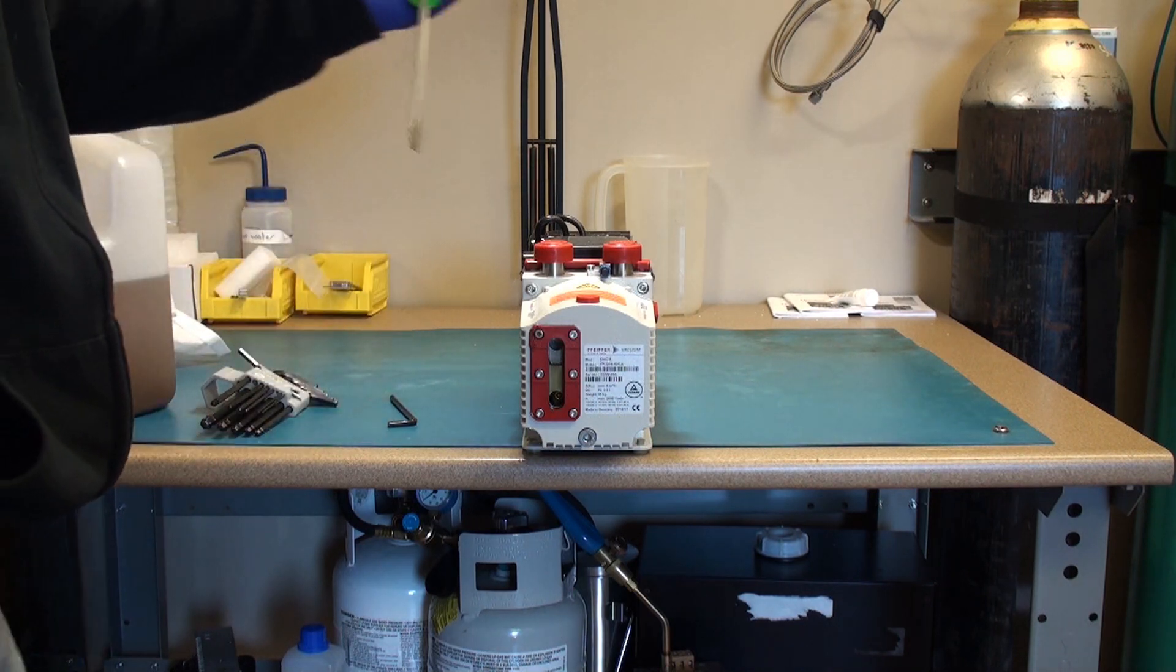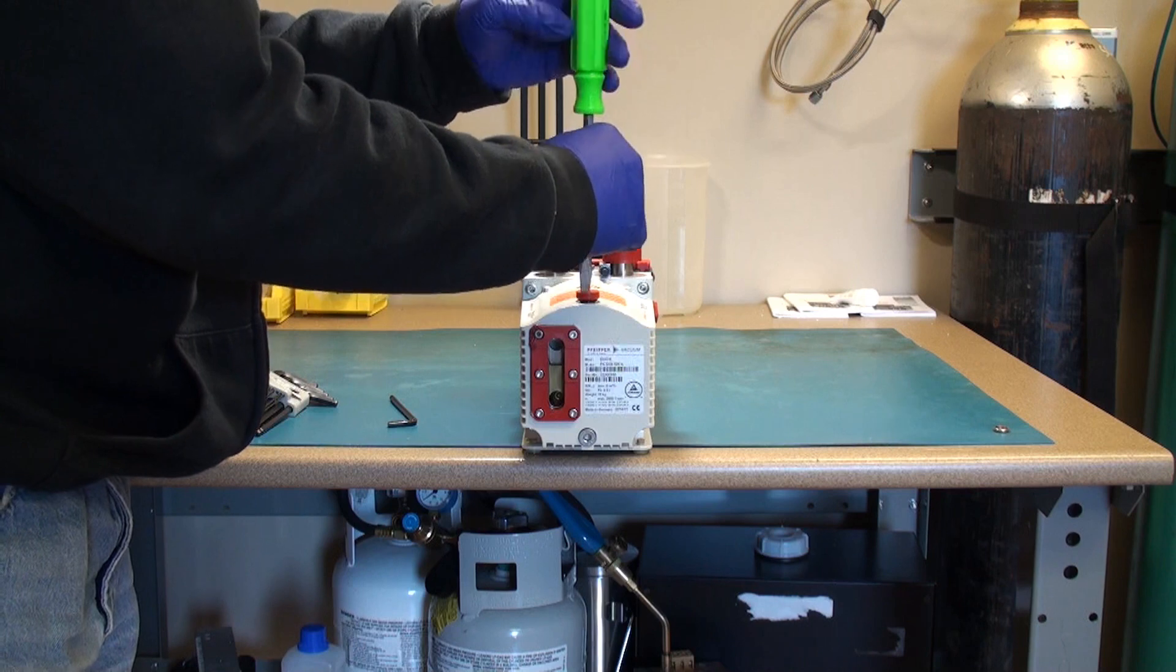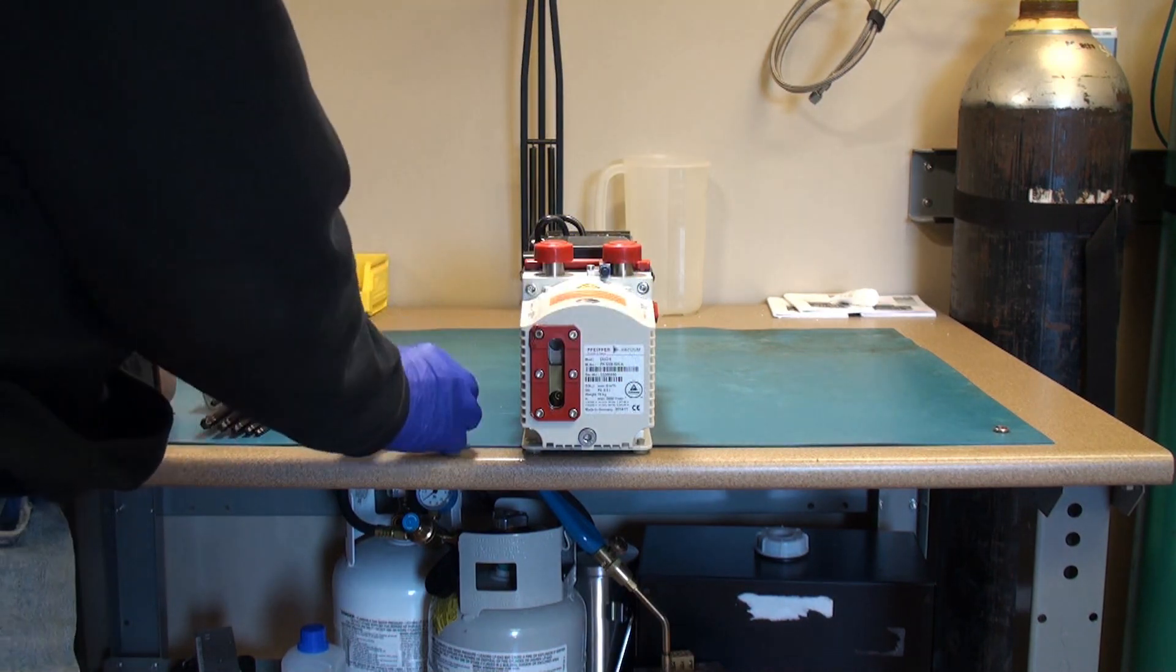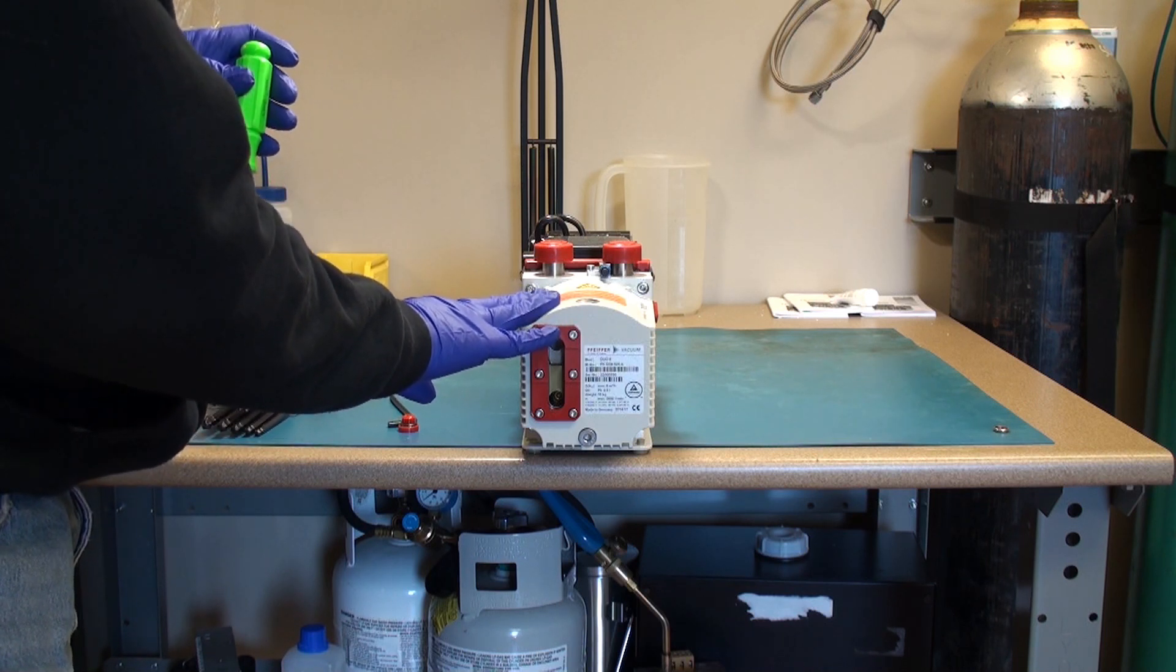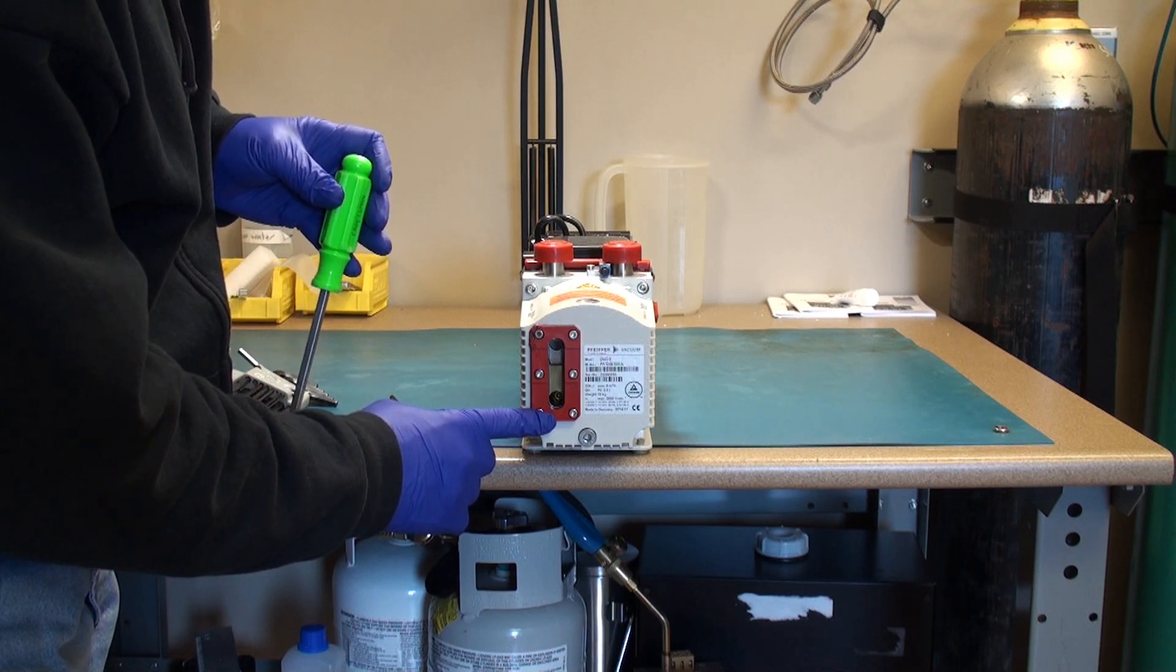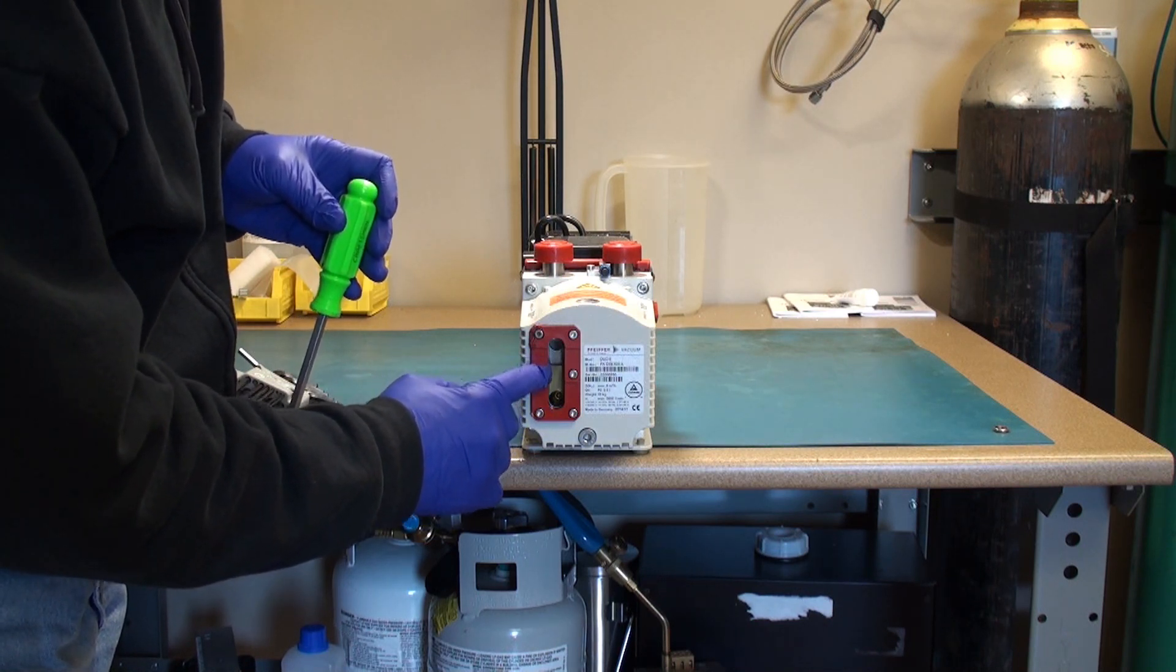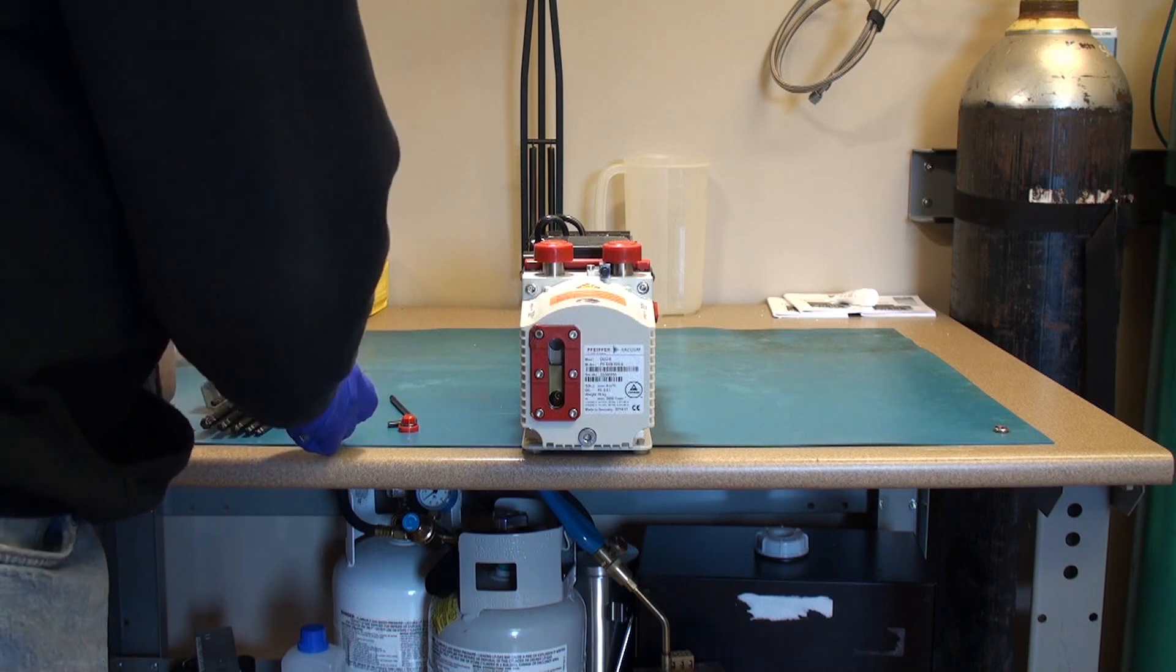First thing you do is you open the fill port on the top of the pumping end of the rotary vane pump. On that part you can see that there's a sight glass. It shows you the oil level.